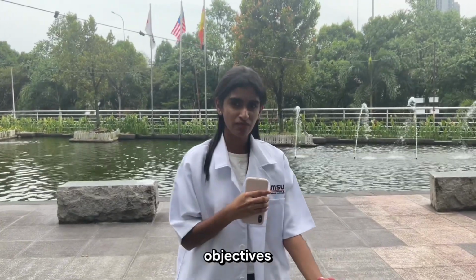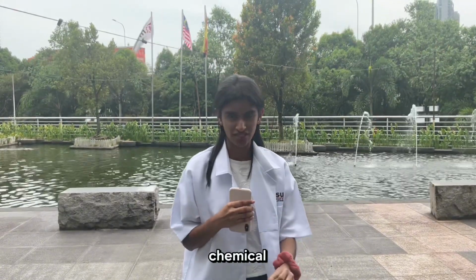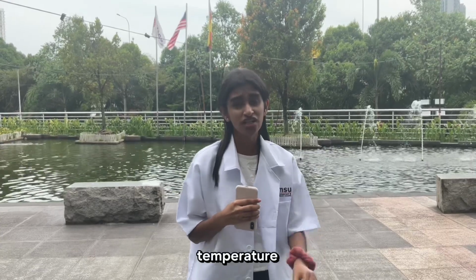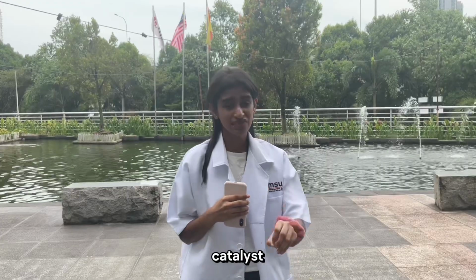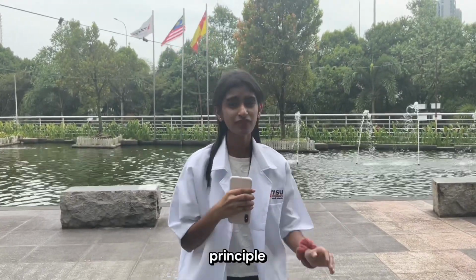Hi, now I'll be telling you about the objectives of the experiment. One of the objectives of the experiment is to learn the concept of dynamic equilibrium in chemical reactions. Next, it is also used to predict how changing temperature, concentration, pressure, or adding a catalyst shifts chemical equilibria using Le Chatelier's principle.